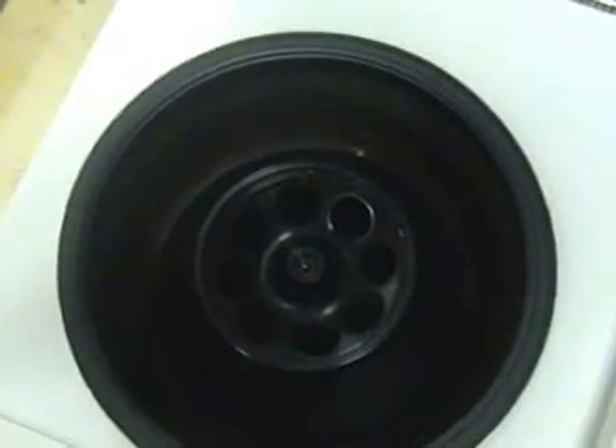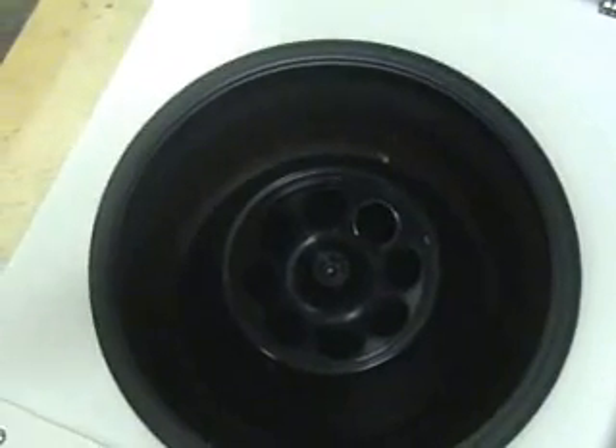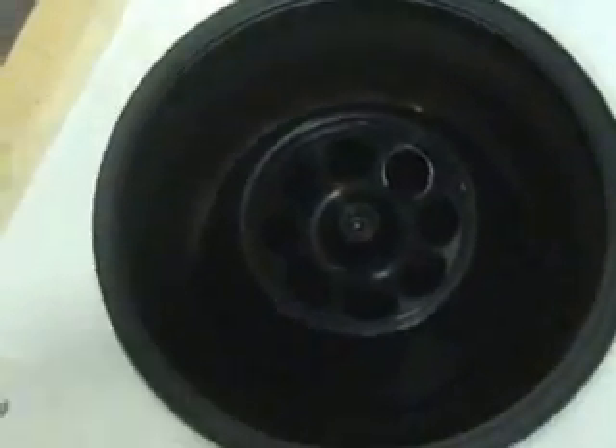13,500 RPM, HFA 13.5, number 3746. All of that is displayed on the cover.